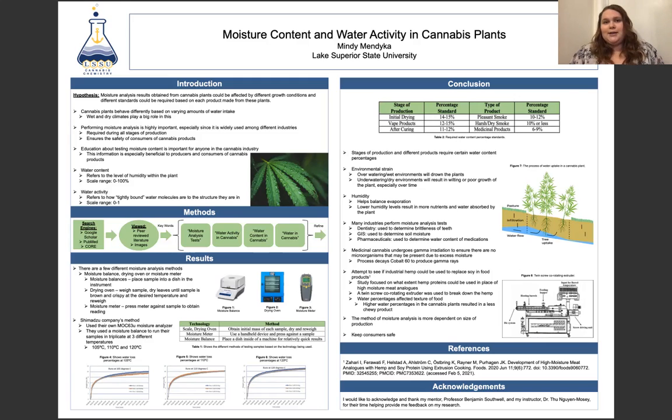The three temperatures that they had set their instrument at were 105 degrees Celsius, 110, and 120 degrees Celsius. And each duration went for 15 minutes. And then it was concluded that the samples run at 120 degrees Celsius did have the biggest amount of water loss. And that is expected because at higher temperatures, you're going to have a higher rate of evaporation.